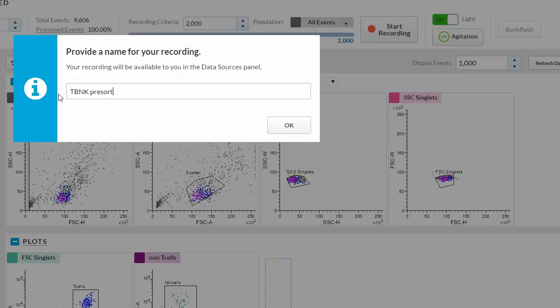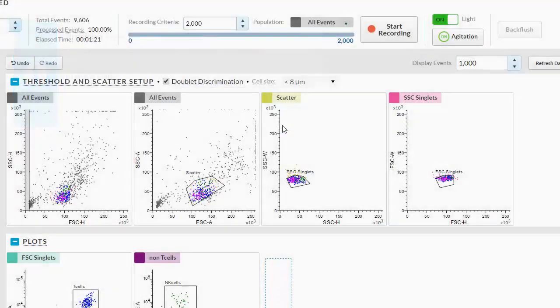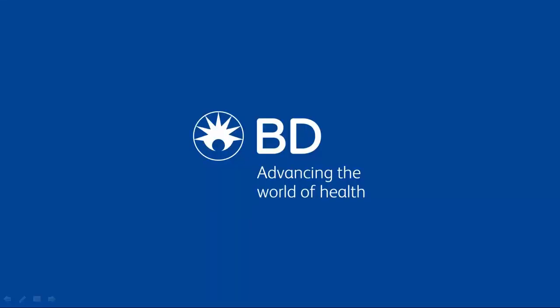The recording will be available to you in the Data Sources panel. This concludes the BD FACSMelody View Data Tutorial. For more information on any of these procedures, please refer to the user's guide. Also, be sure to check out the rest of our BD FACSMelody cell sorter videos.